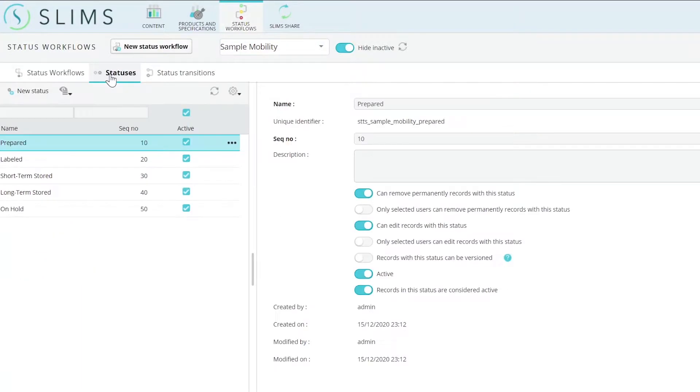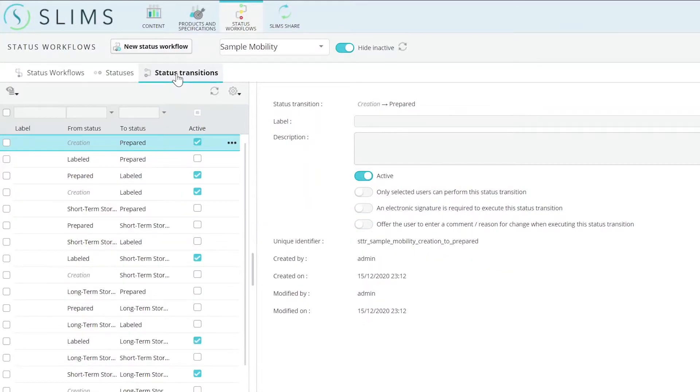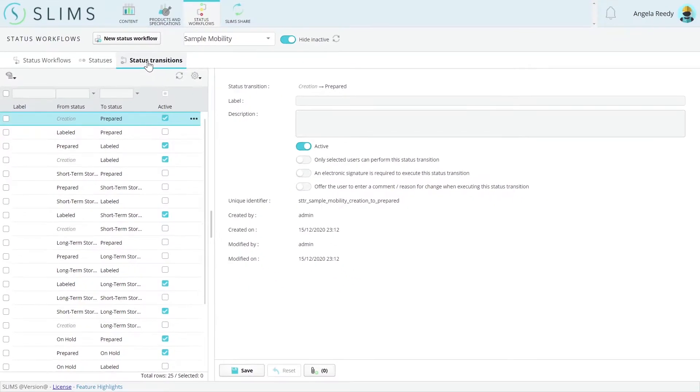Likewise, all possible statuses and status transitions were moved into this module to support your instance, whether you are upgrading or starting from scratch. These tabs allow custom status workflows to be created.